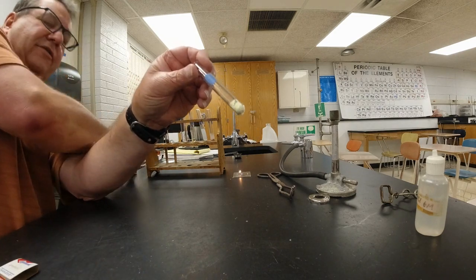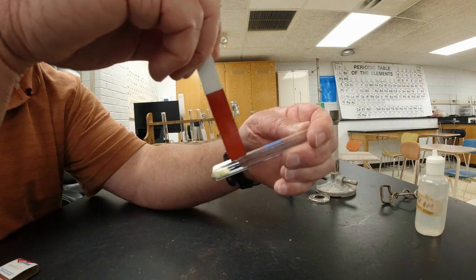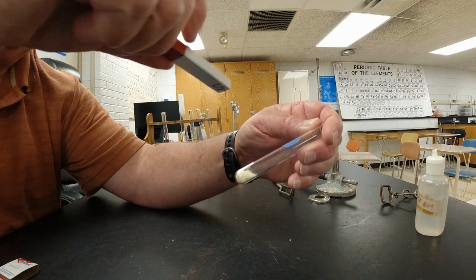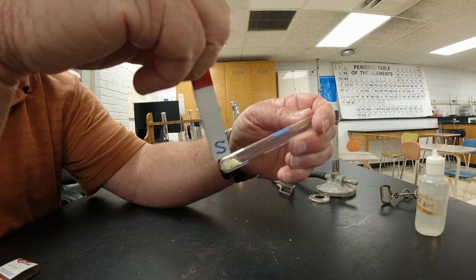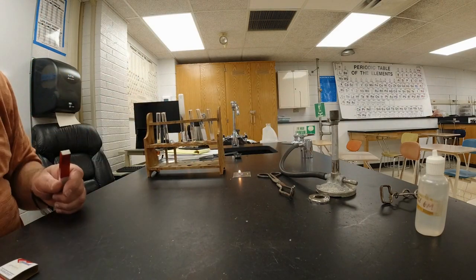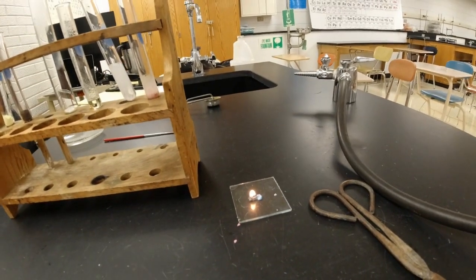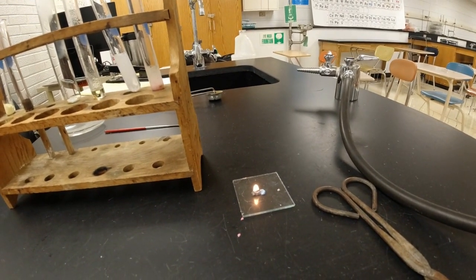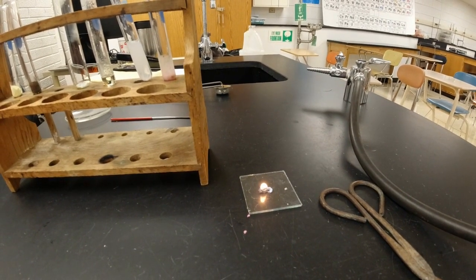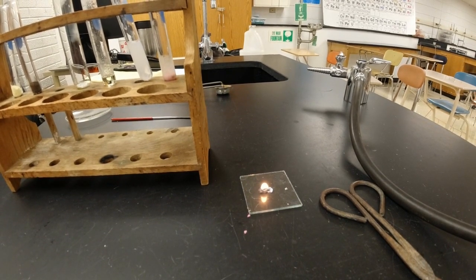But I'm going to do another test that we haven't done. I'm going to take a magnet and I'm going to put it to the sulfur, and I want you to notice that nothing is happening when I put either end of the magnet, north or south. Nothing happens to the sulfur. All right. If we look at our candle over here, our candle is just about gone. We're probably going to go out here in just a second, so we'll wait. I bet you guys want to make a wish and blow it out, don't you? But it's going to go out in a second anyway.